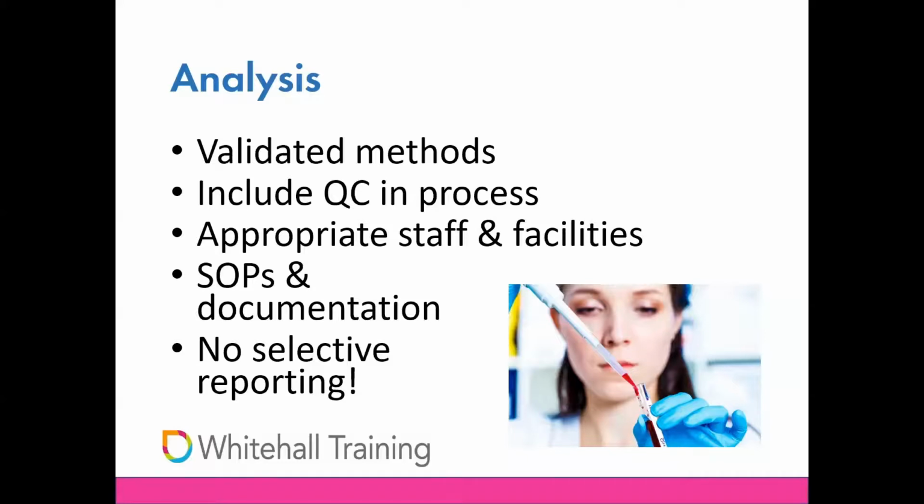The criteria identifying when an analysis can be repeated should be defined and made very clear in the SOPs or materials. There should be no repeat analysis unless these criteria are met. It is vitally important that there isn't any selective reporting of results, and that where data are repeated or removed as outliers, you can justify the reasons, and that their reasons are transparent and documented.